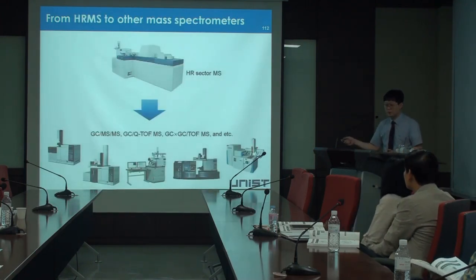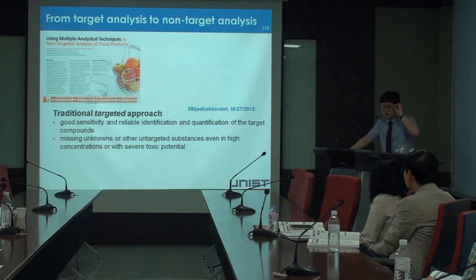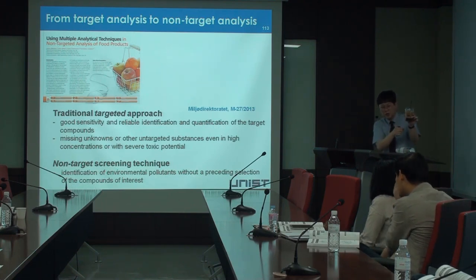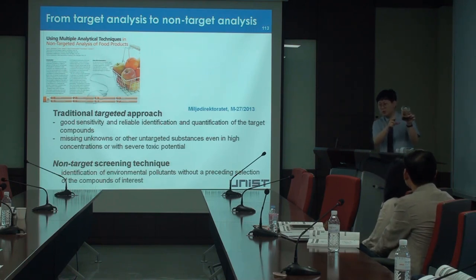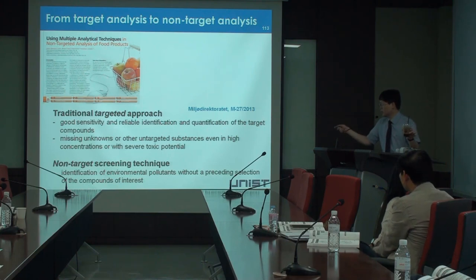And also another issue. The first issue is this one, using different instruments for POPs analysis, and the second one is from target analysis to non-target analysis. So previous analysis is target analysis. It means that there are target compounds. We want to analyze dioxin, or we want to analyze PCB. Okay, this is a traditional method. For target analysis, we have to select only dioxin. So we need very long cleanup procedures and high resolution MS to only select dioxin. This is a target approach.